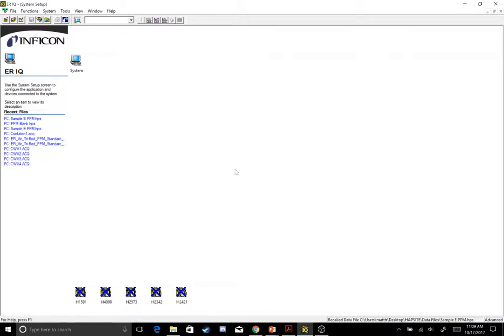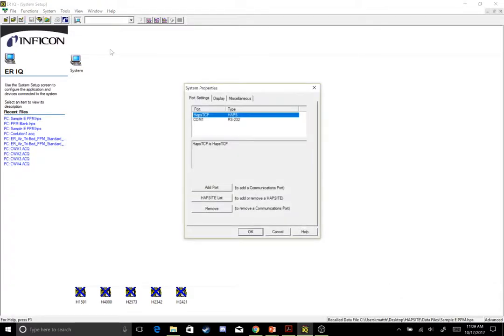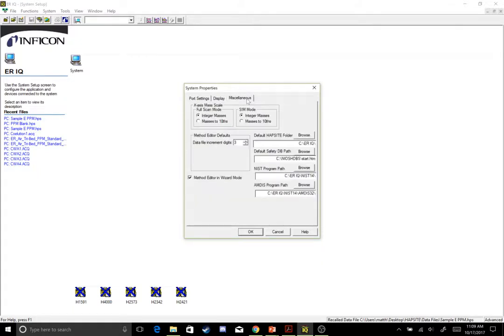Now that we're in Advanced mode, we're going to first set up our NIST library. So we'll go back to Tools, we'll go to System Properties, then to Miscellaneous, and you have these four drop-downs over to the right. Make sure that they all match up with what I have over here.